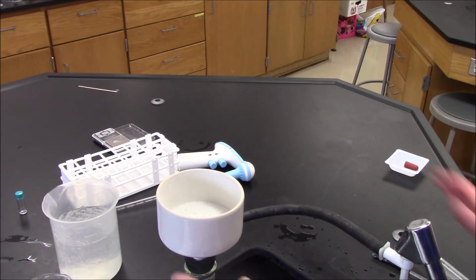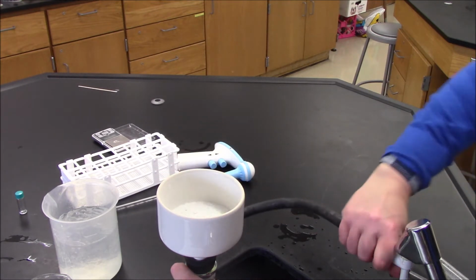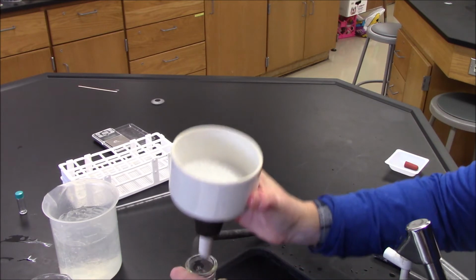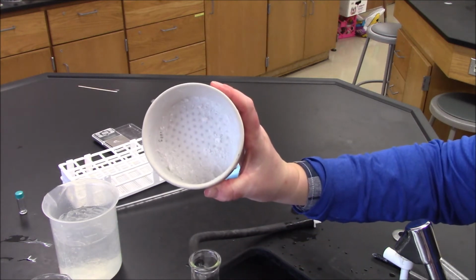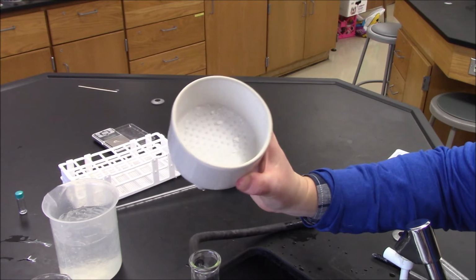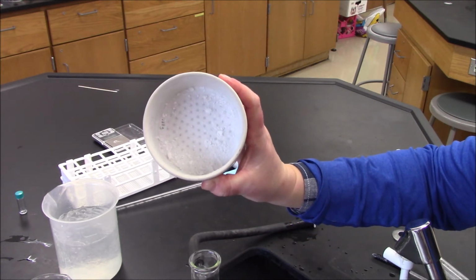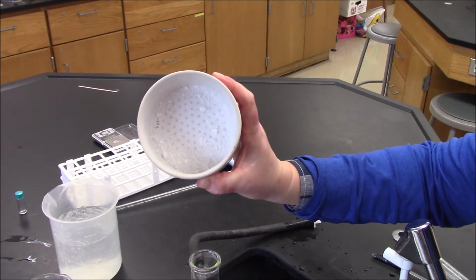Okay. Now what I have here in my funnel is my crude acetylsalicylic acid. I'm going to let this dry overnight and weigh it. I'll recrystallize it tomorrow and attempt a boiling point. I'm sorry, a melting point.